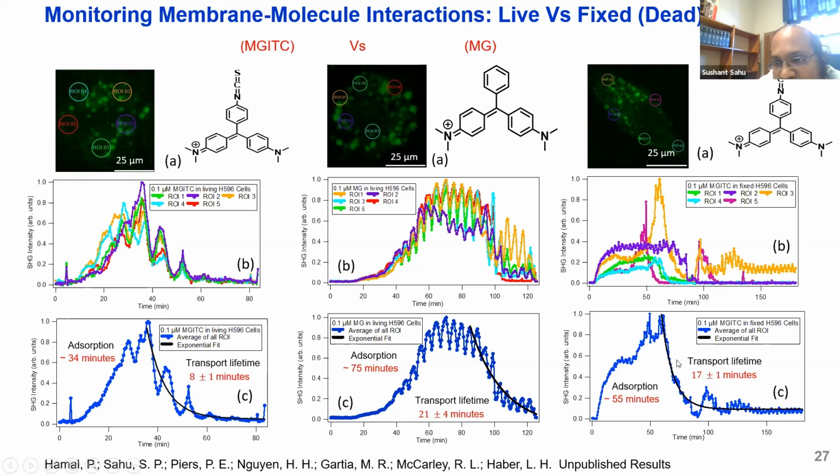Okay, so you can get the rate constants from this, and we also see these subtle fluctuations in the intensity, which I'm currently working on analyzing. We think it is either due to experimental artifacts associated with instability in the laser, or due to some complex biological function of the cellular metabolism. So this work is still in progress.